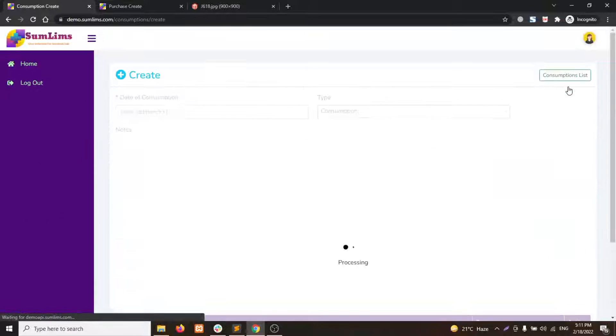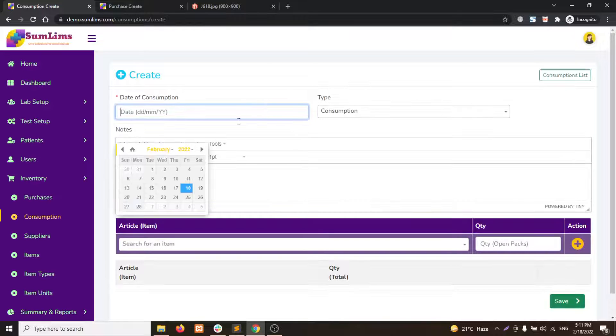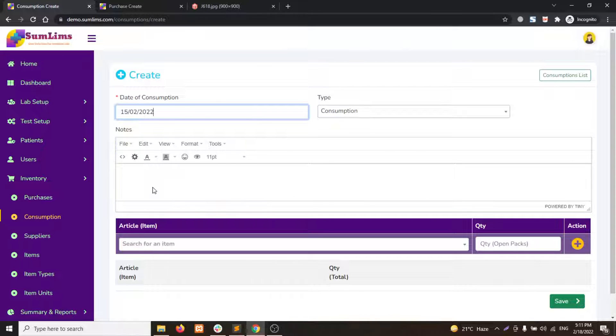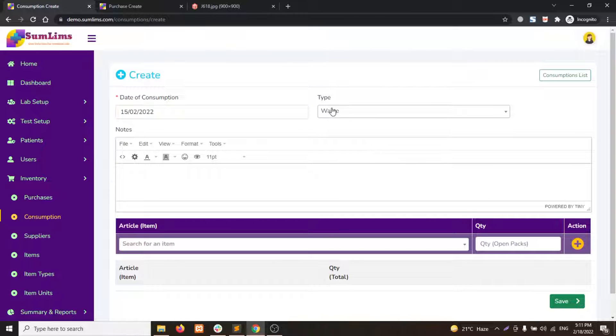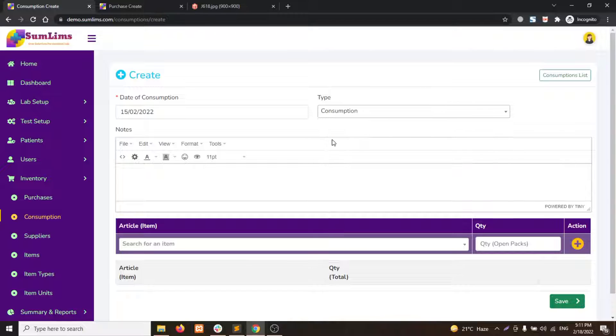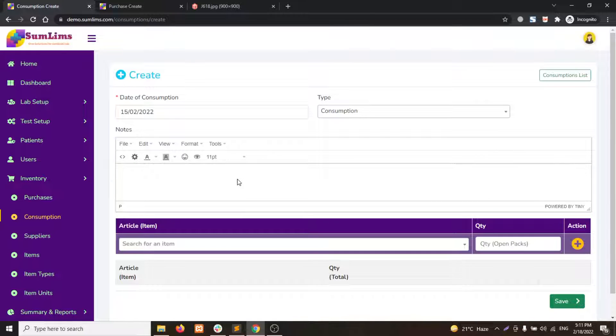Once the page is loaded, you can select the date of consumption from the calendar. You can choose the type, either wastage or consumption. You can write down any additional information for your own purposes.